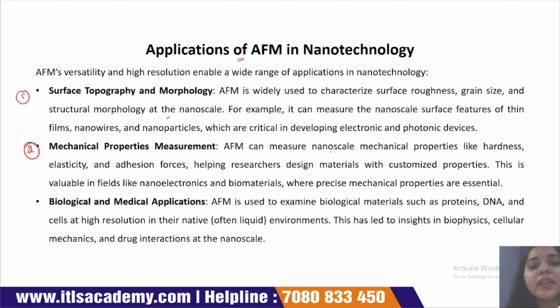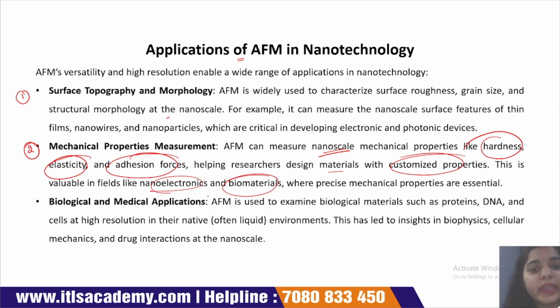Next is the mechanical property measurement. AFM can measure nanoscale mechanical properties like hardness, elasticity, and adhesive force, and helps researchers design materials with customized properties. It is valuable in fields like nanoelectronics and biomaterials, where precise mechanical properties are essential. With the help of atomic force microscopy, we easily measure the mechanical properties at nanoscale.